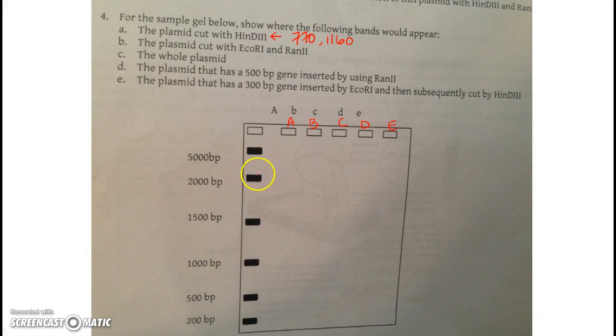Okay, now remember how I said in the left lane we always run pieces where we know the length. So this piece right here we know is 5,000 base pairs. This bottom piece is only 200 base pairs. Remember, the smaller it is, the further it can go. And so we've got this 770 piece, so we literally just estimate where that's going to go here.